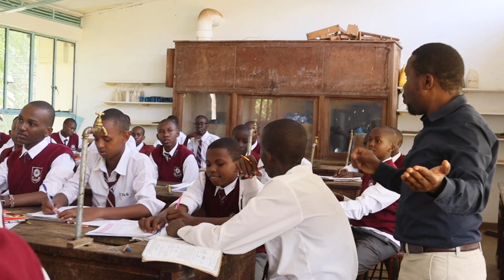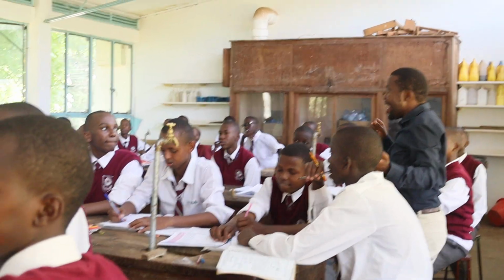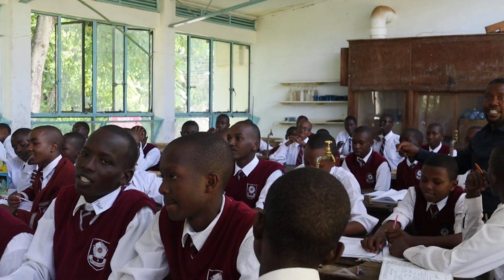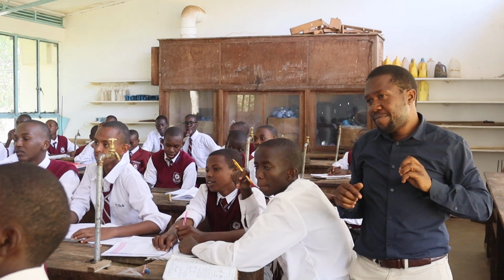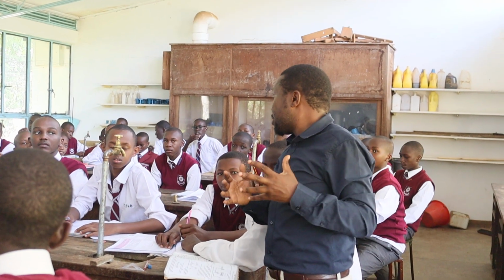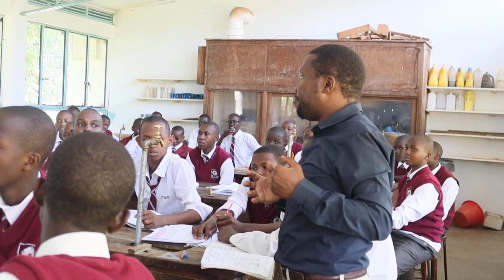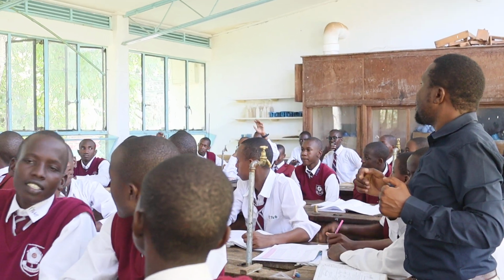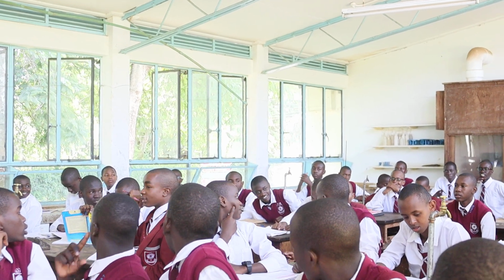Any other observation? There is one observation which is very conspicuous. Can we use our ears? Yes? Very good. It burns with a roaring sound. Now, based on those characteristics, what can we conclude on the name of the flame? Yes, Jeremiah? The name of the flame is non-luminous.